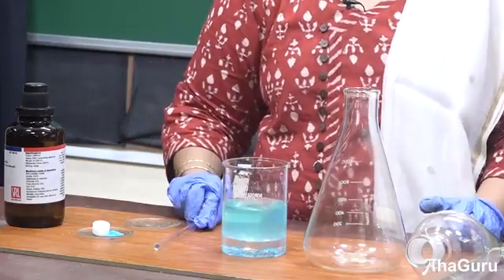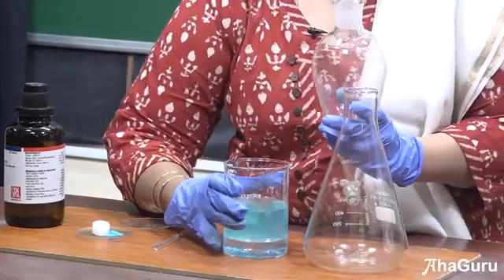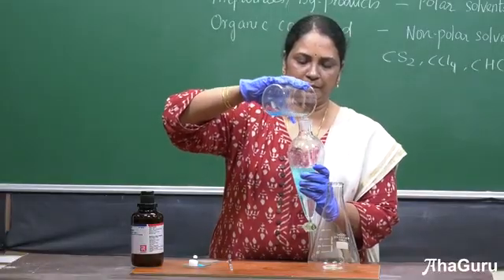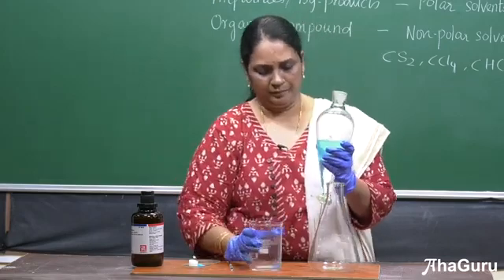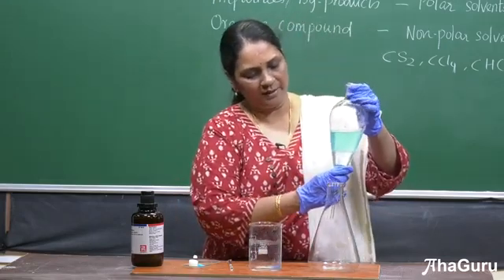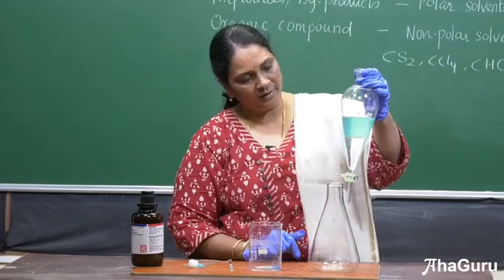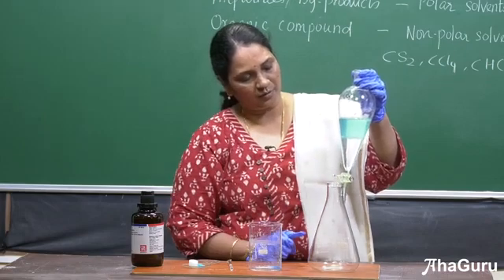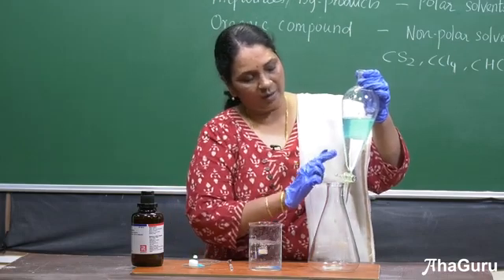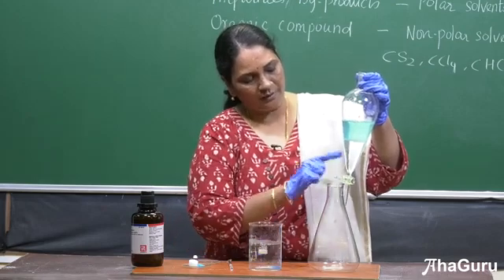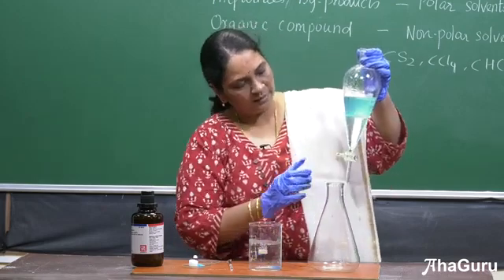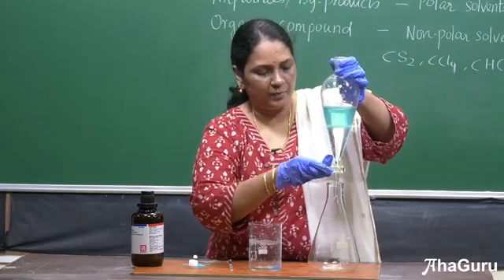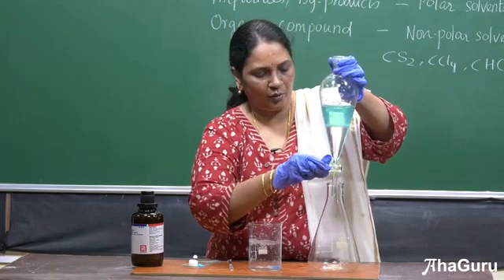Now I am going to take this mixture and transfer it to a separating funnel. You can see the two layers very clearly — the top layer is blue in color. The copper sulfate has dissolved in water, and the white powder which was naphthalene has dissolved in the chloroform layer. Now you can separate these very easily — just open the knob and remove the chloroform layer.